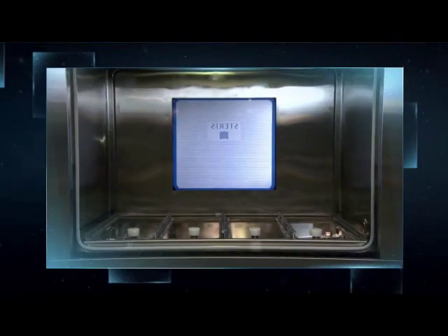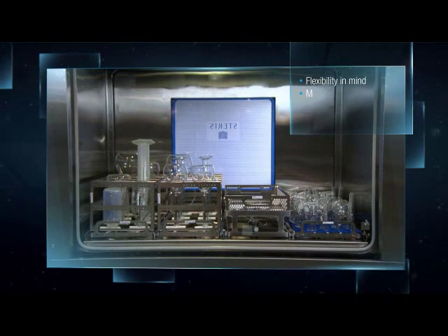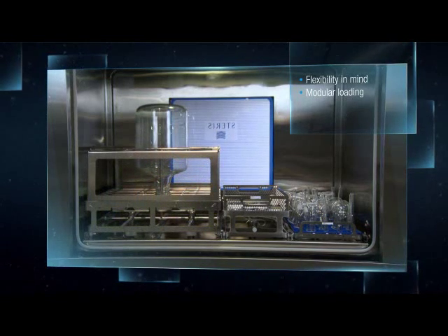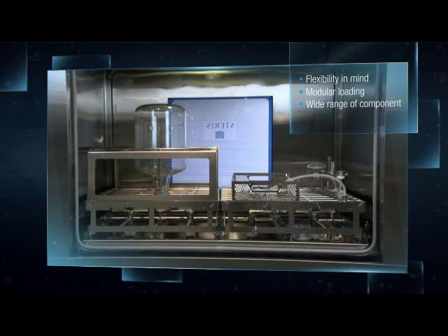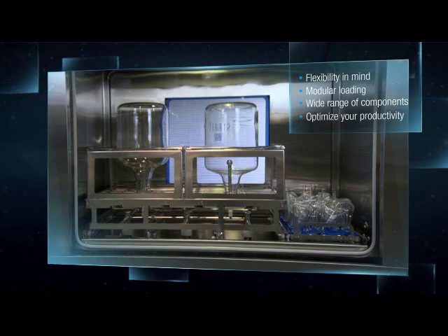The 480PG washer was designed with flexibility in mind. An extensive line of modular loading accessories can easily be configured to accommodate a wide range of components simultaneously, which optimizes your productivity and turnaround time.